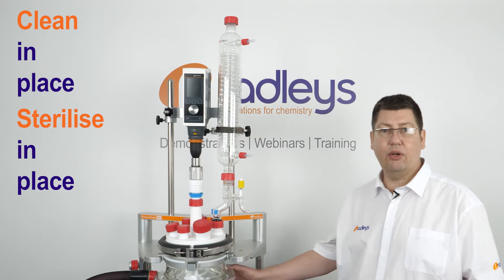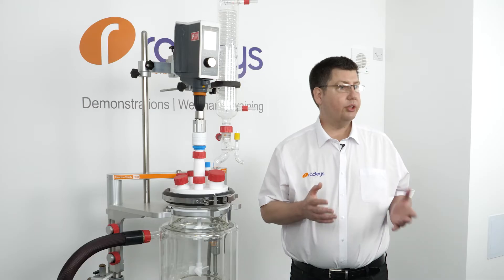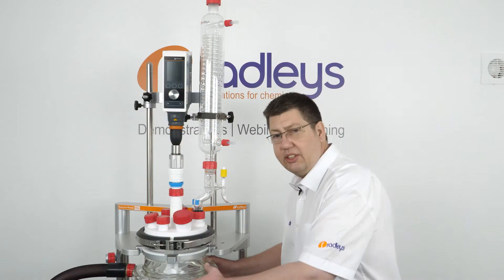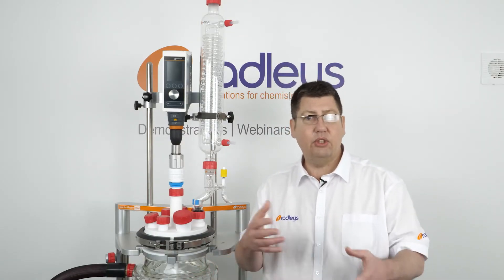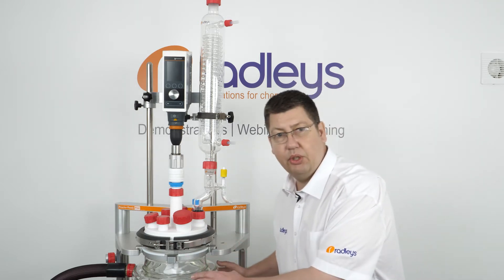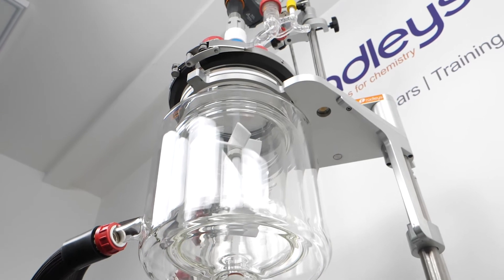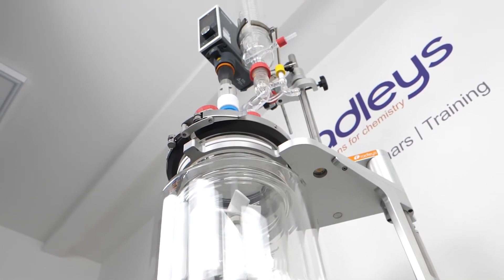CIP and SIP equipment and procedures have become increasingly common. As we scale up chemical processes, the equipment gets larger, more cumbersome, more difficult, more impractical to deal with — to take out of frameworks, put into vacuum ovens, and hours later take them back out of the vacuum oven and reassemble them into the framework. Setting a system up and then drying the glassware in place reduces the risk of damaging glass components and eliminates exposure to moist air by not moving them around the lab.